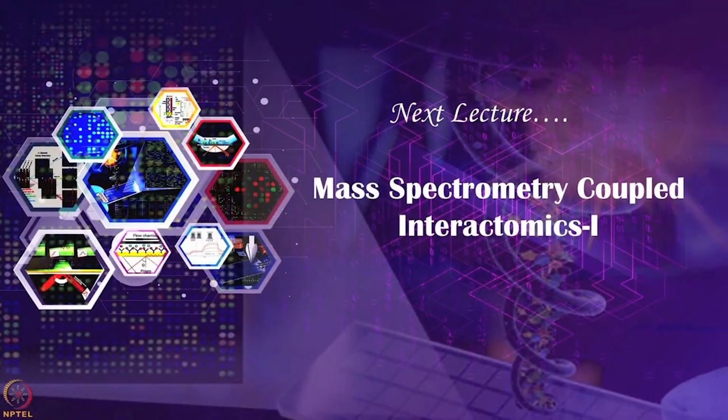In this light, new technologies are coming forward, and today we try to provide you interaction with one of the leading companies and their application scientists, who talk to you about MST technologies and also the quality control assays done using Tycho technology. I hope these provide you some insight about how to do your experiments for the proteins to further characterize using the latest label free biosensors. Thank you.